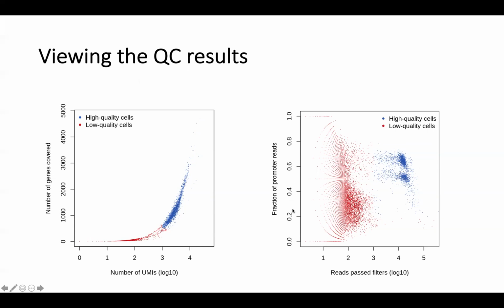Yeah, so here, when you're looking at open chromatin regions, that's single cell ATAC-seq. So yeah, this is RNA-seq, this is ATAC-seq. Great. And I think probably this is the one that you're looking for. I think they ask you to download the ATAC-seq one. Great. Okay, so if there's any more general questions about part one, I can take that now.